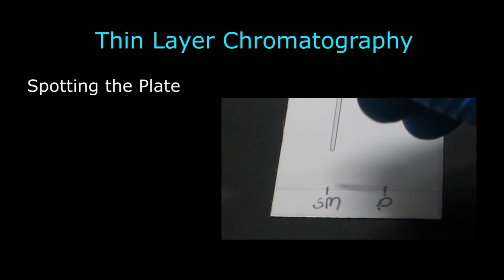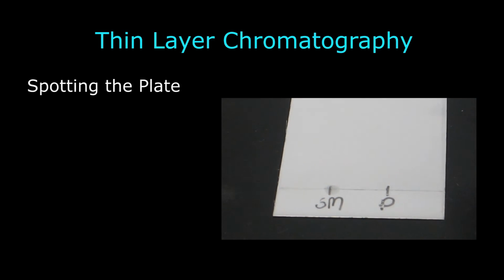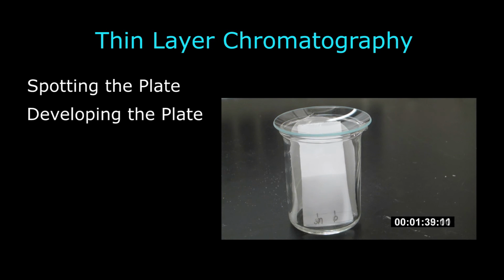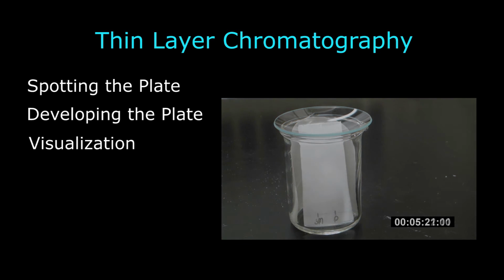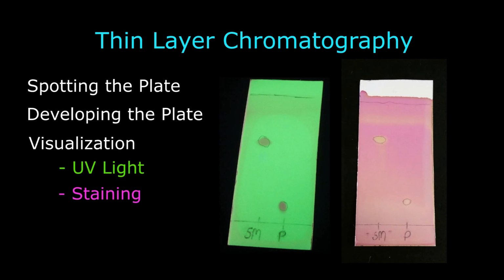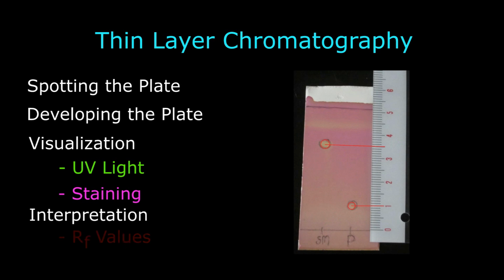To briefly review, in performing TLC, samples will first be spotted on a TLC plate. The plate will be developed in a developing chamber with an appropriate solvent. Once eluted, the plate needs to be visualized. Common visualization techniques include UV light and staining. After the plate is visualized, interpreting the plate is done by comparing RF values.